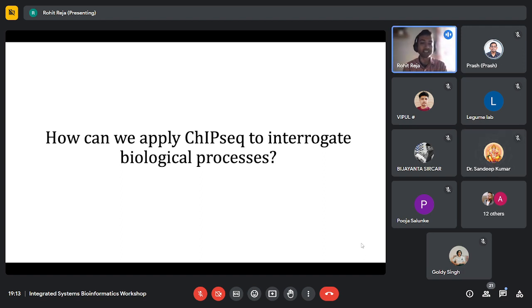That's a great question, and that's actually a real problem in ChIP-seq. I'll give you an example. There is a family of transcription factors called IRFs. There are 9 IRFs: IRF1, 2, 3, 4, 5, 6, 7, 8, 9. If you're interested in only looking at IRF1, for instance, the antibody might, for the reasons you've mentioned, be a problem because they're basically homologs of each other, so the antibody might recognize IRF2 or IRF3.